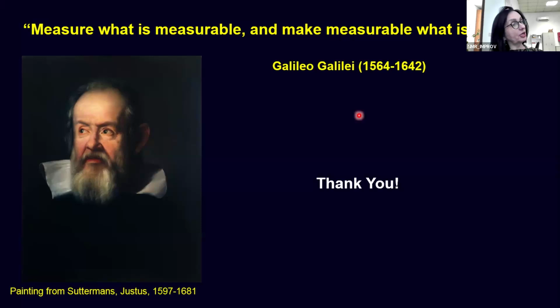I would still be of the opinion that selecting the right model is the step which creates the highest danger. Okay, but we are speaking of two different things, Danuta. What I showed was the way you have to do it the first time. Once you validated your model, it's okay. If now I change the lipid, I will not reproduce all this history. I will fit, and I will get the elastic constant, and I will transform it.